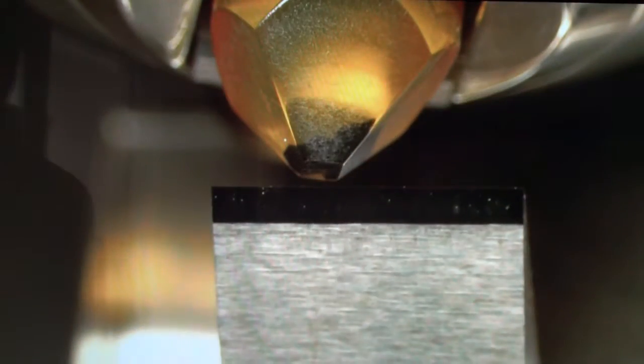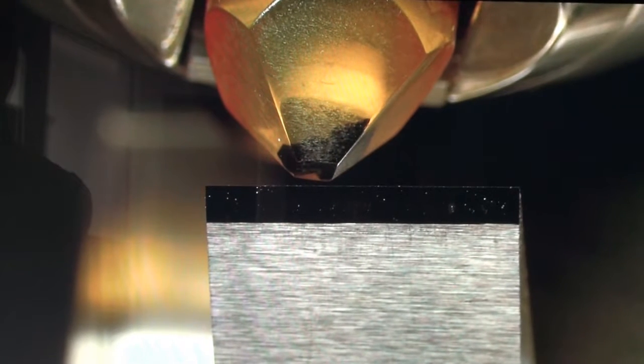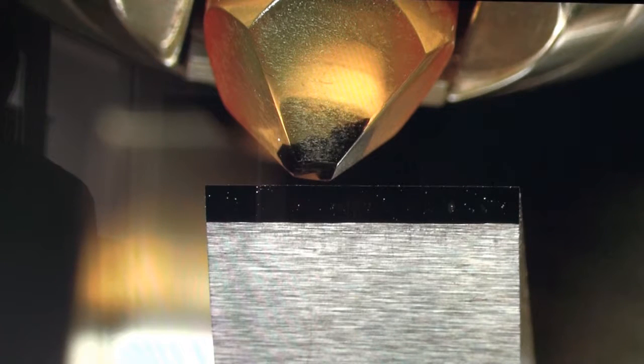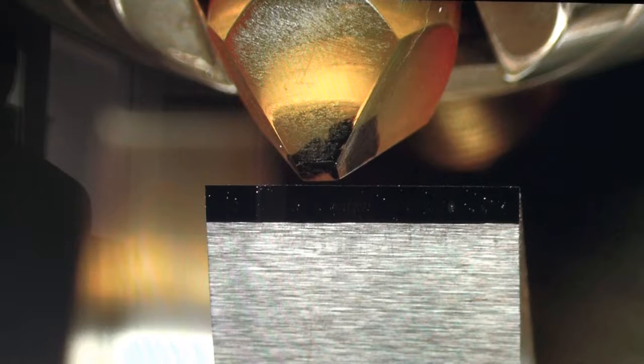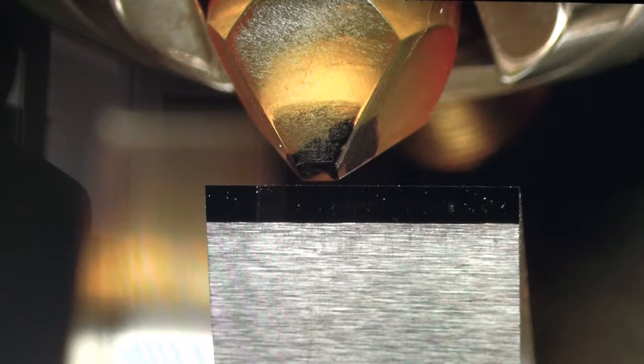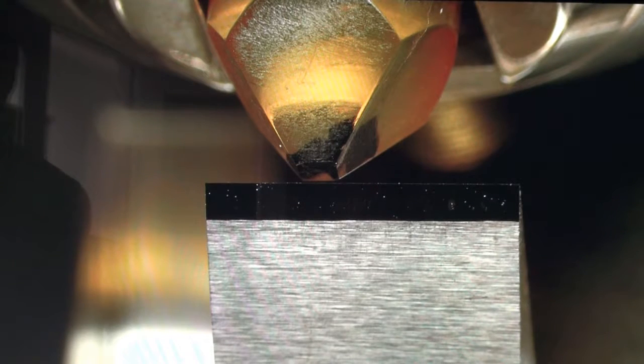I've loaded my rough trimmed block into the Ultra Microtome and advancing my knife. And we can see it's a nice straight line across there, whereas sometimes you get a little bit of a half-moon curvature for glass knives. So what we're going to do is adjust my specimen rotation for my leading edge. It's not real critical at this point since we're just facing off, but it's always good to be as accurate as possible.